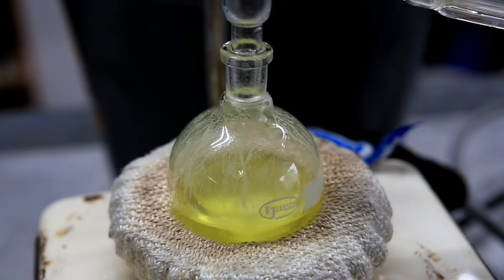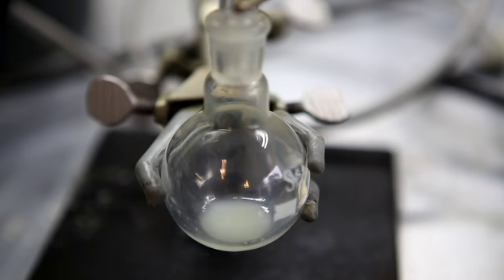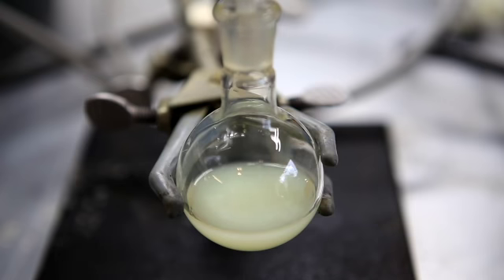For safety reasons, do not let the distillation flask get any hotter than 214 degrees Celsius. Also, it's important to not distill until dryness. As the distillate came over, it should be a cloudy white color because there's still water present in it.